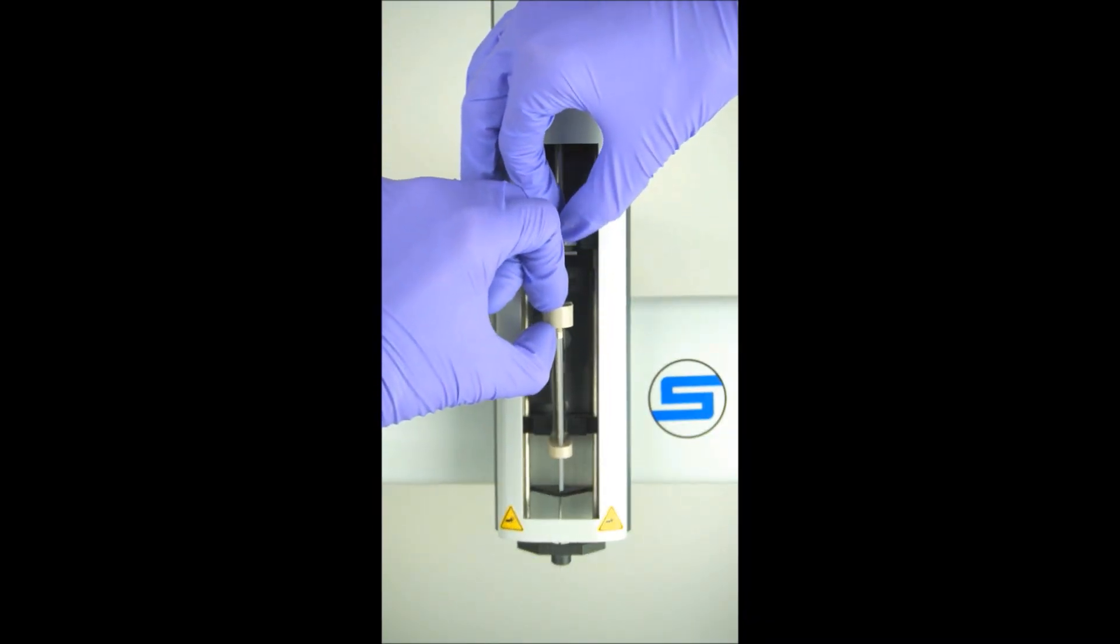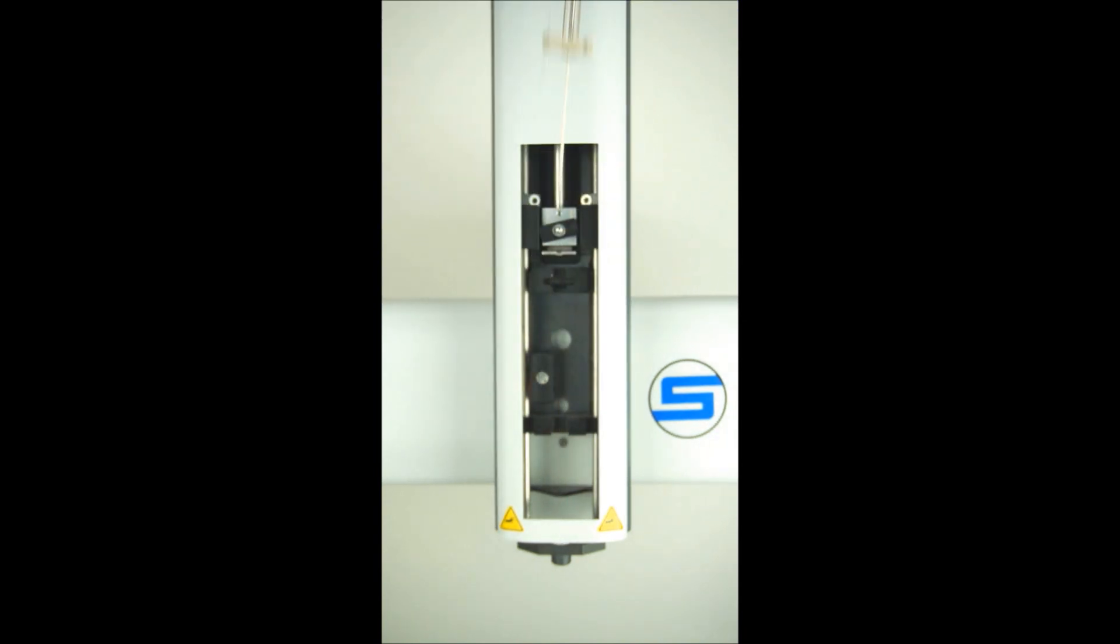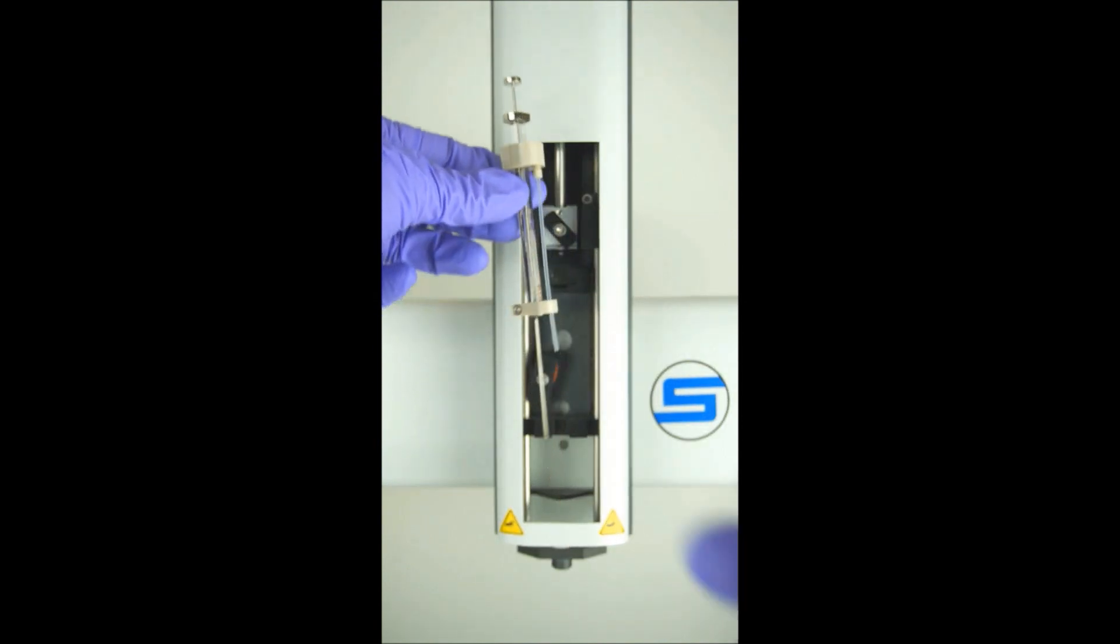While holding the clamp open, gently remove the syringe by grabbing onto the plastic upper syringe barrel housing. Turn it 90 degrees and remove it from the needle guide by pulling up.